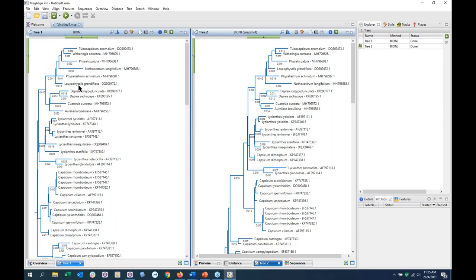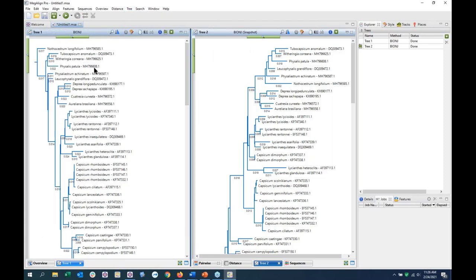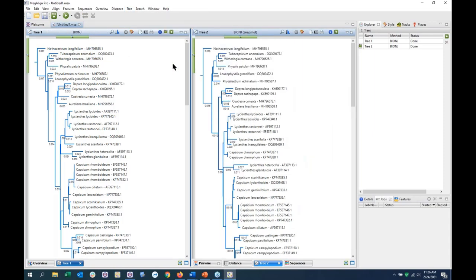From looking at previous phylogenies of capsicum and Solanaceae, I know that Nothocestrum is the most distantly related sample in this dataset. So I can go to Tree > Root On > Selected Branch, just selecting that branch to designate it. After rooting both trees on Nothocestrum, I can get a better layout of the relationships. Just looking at the coupling, I can see a minor difference — by changing the distance matrices, I was able to actually rearrange the structure of the phylogenetic tree.